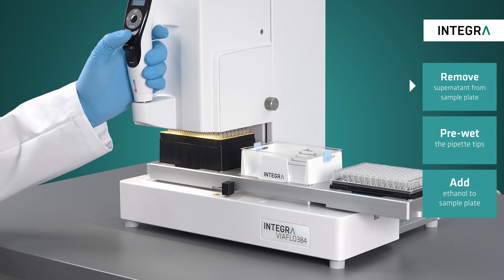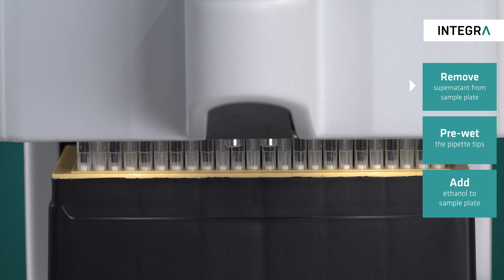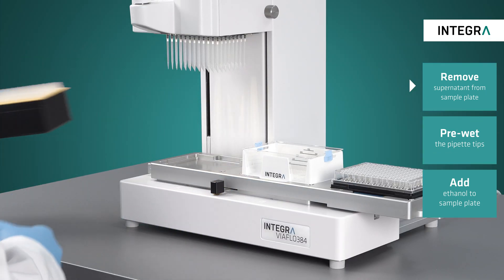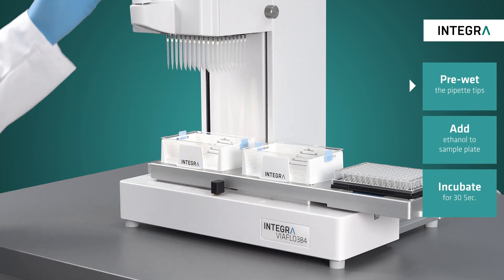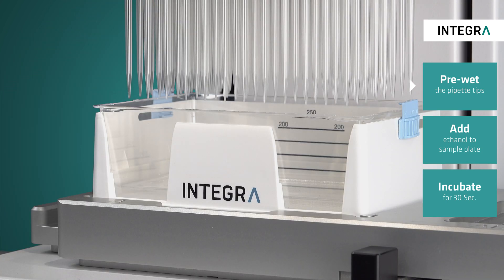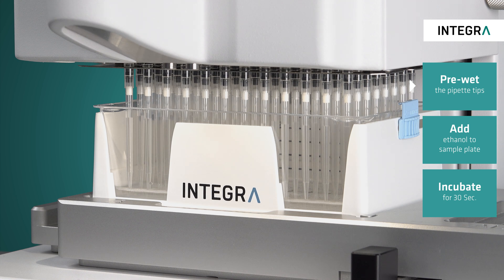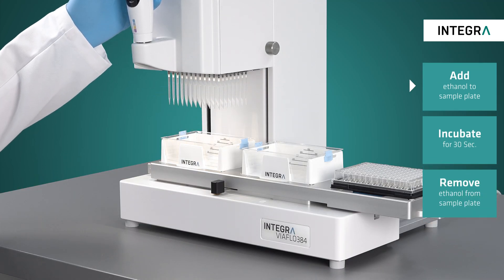Next the washing steps can begin. Before starting, fresh tips are electronically loaded after the used ones are ejected. The tip rack is removed and in its place the reservoir containing 70% ethanol is added. Before we begin pipetting with ethanol it is important to pre-wet the tips with ethanol first to help prevent dripping tips, since ethanol can be tricky to pipette. The low retention tips really help as well.